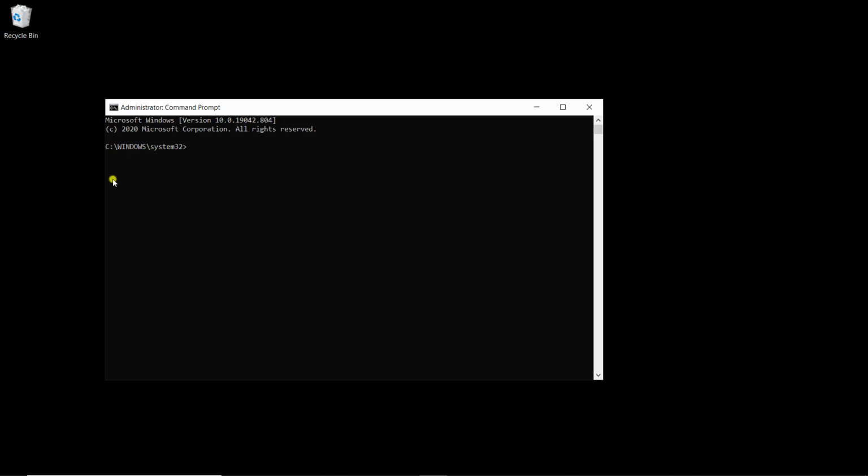All right. So now the first thing I'm gonna do is to activate my virtual environment. So I'm gonna go in my folder, which is in work, and now activate it. So if I do the name of the virtual environment, dlr, then scripts, and then activate. I activated my virtual environment. And now the system can see the Jupyter notebook that was installed in this virtual environment. So I'm going to run R from there.